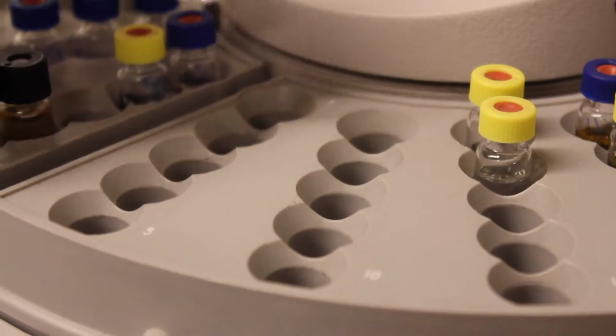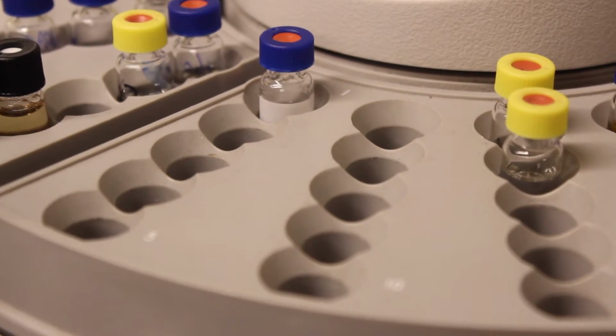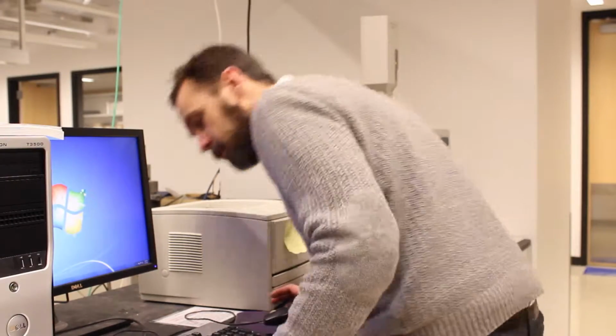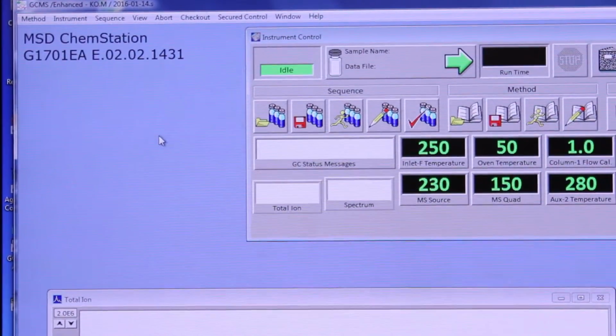Place your prepared sample vial in the sample changer. Be aware that the location numbers increase from the center outward, so the next location after 5 is 6 back here. Now let's go over to the computer and set up our experiment. The GCMS window should already be running, but if it isn't, you can start it from the icon on the desktop. The method you'd use depends on whether there's a sample running on the sample changer already or not.